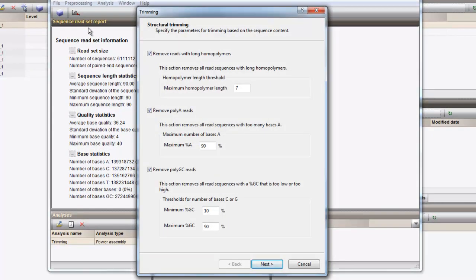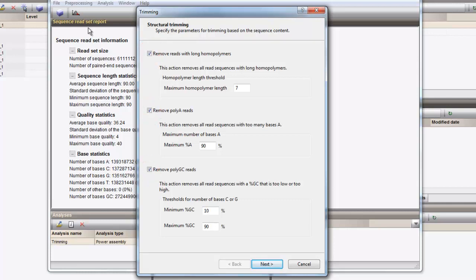The wizard will query for the criteria that should be used for the trimming operations. To exclude a specific trimming operation, simply uncheck the checkbox in front of the description. For example, we can unselect structural trimming based on polyA and polyGC reads.